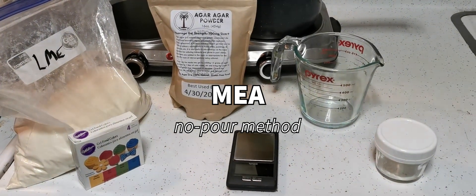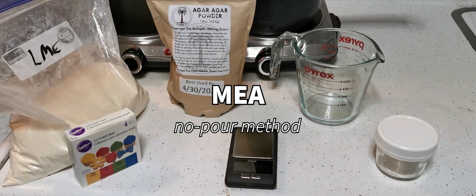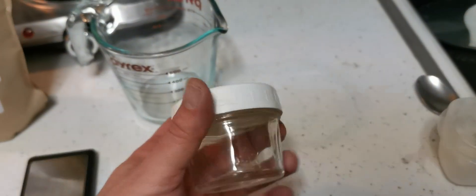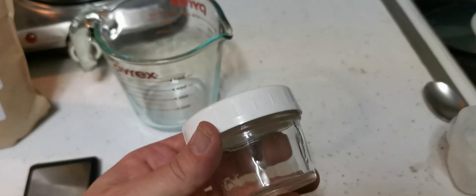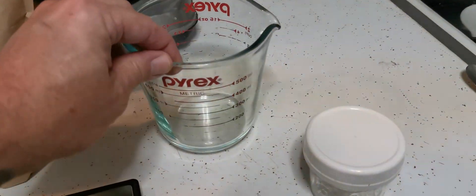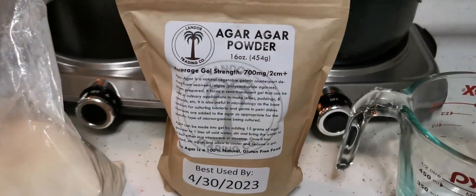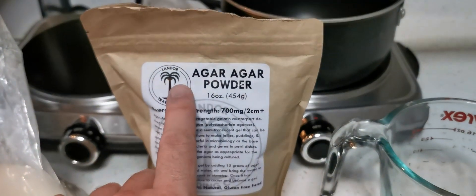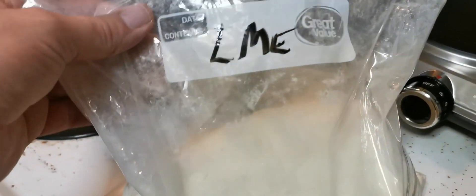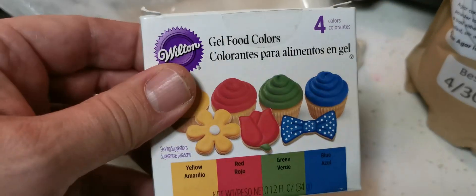MEA no-pour method using quarter pint or half pint jelly jars with plastic no-mod lids for our containers. These are available at Walmart or online on Amazon. We're going to need 500 milliliters of water, agar powder available on Amazon, light malt extract from Amazon or any brewing supply, and some food color.